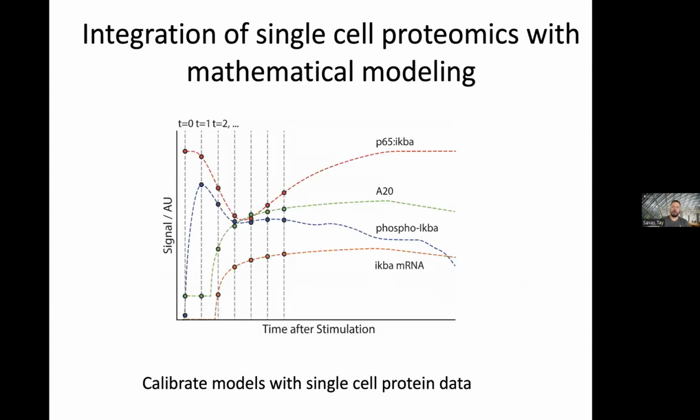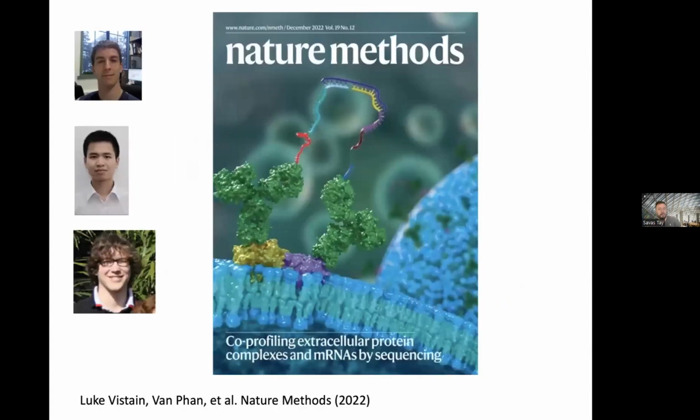All right, so moving forward, if we have a model like that, especially if we can also measure protein complexes, then over time, with a technique like that, we can model things and come up with accurate computational simulations. To achieve that, we have developed this technique called proximity ligation, proximity sequencing. The way it works is, imagine that you have a protein complex on the cell membrane.